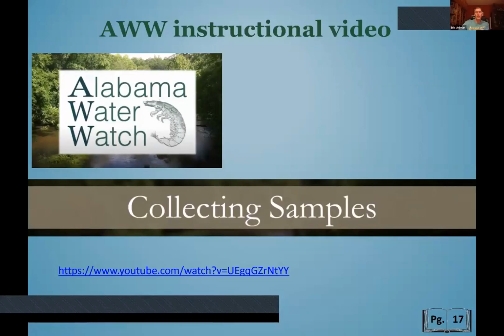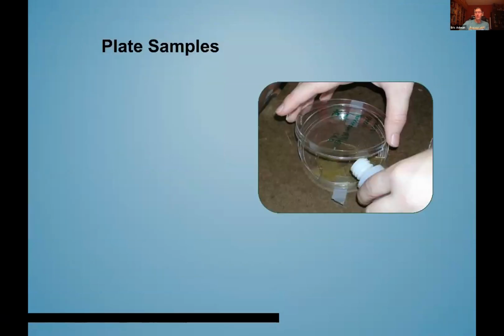Okay, so that was collecting samples. The next stage after you've collected the sample, so we went out to the site, collected our samples with our pipettes, put it into our media, either transported it back less than 30 minutes, not on ice, or greater than 30 minutes, but less than 3 hours on ice. Now we get back to where we're going to do the plating.